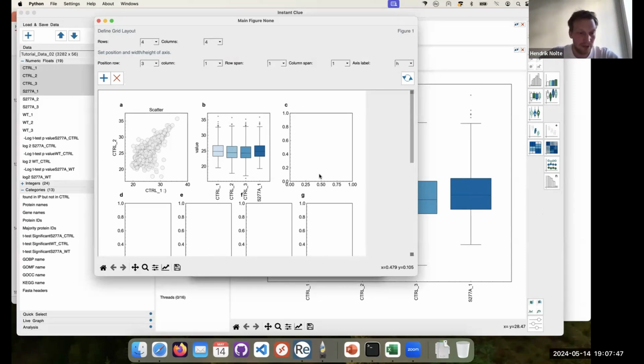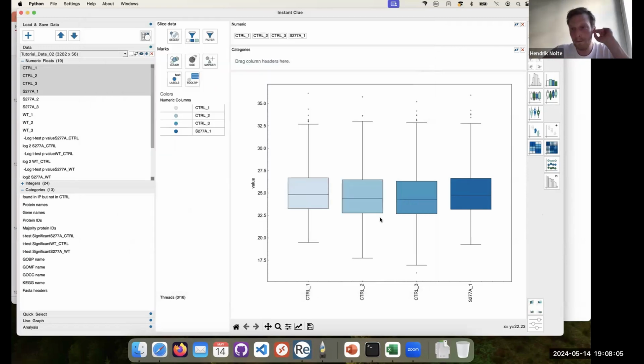Okay, I think this main figure has proven to be relatively useful. I'm basically always using it to export charts, just to make sure that the size, the font size, and everything is aligned and equal between the figures that I export. Okay, good. And then there was some question.